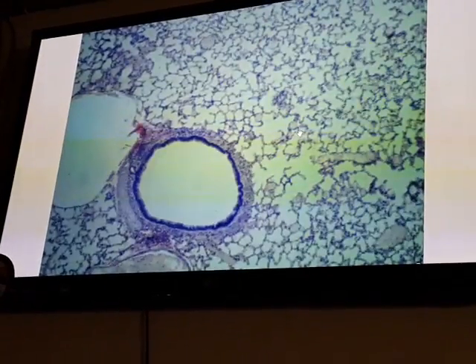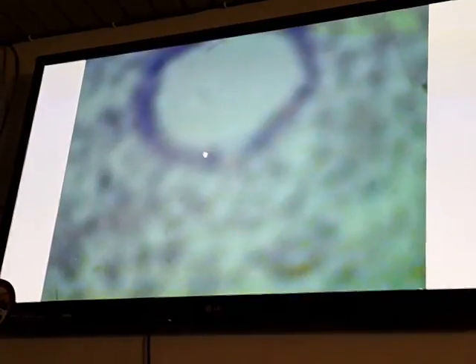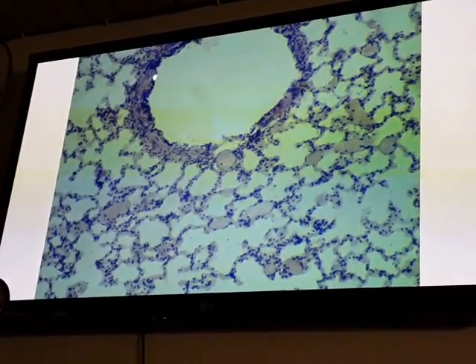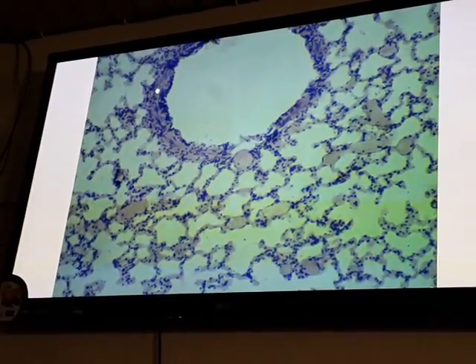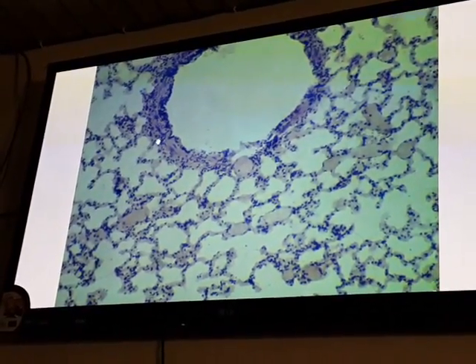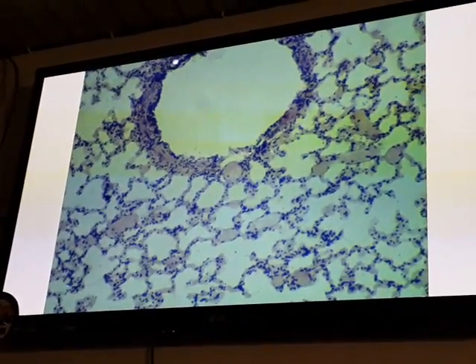Now the bronchiole: without cartilage, without glands. Clear? Is the difference clear? The lining epithelium is simple cuboidal or columnar. The lamina propria contains just smooth muscle fibers with reticular and elastic fibers. No glands, no cartilage. This is the terminal bronchiole.